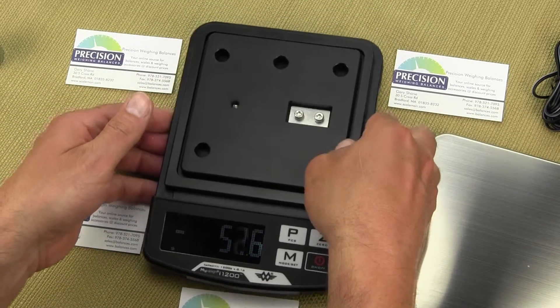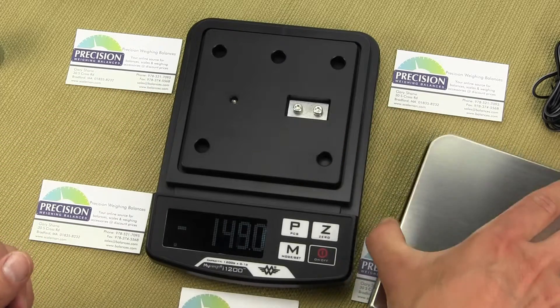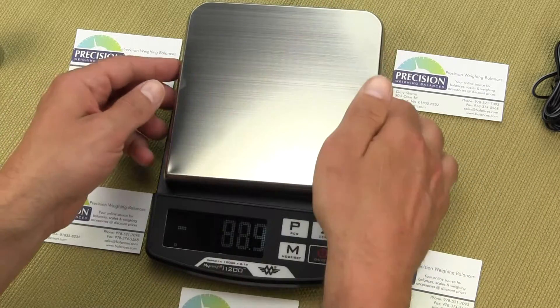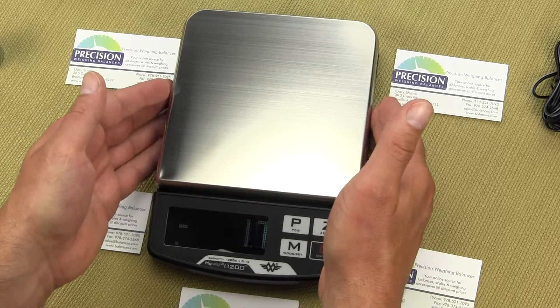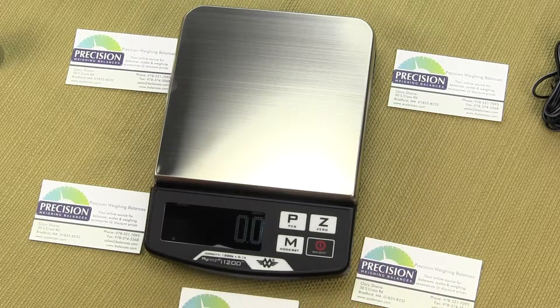It's a very simple design. The only optional accessory we carry is the calibration weight, and we do recommend you buy the calibration weight. The calibration weight required is a one kilogram mass.